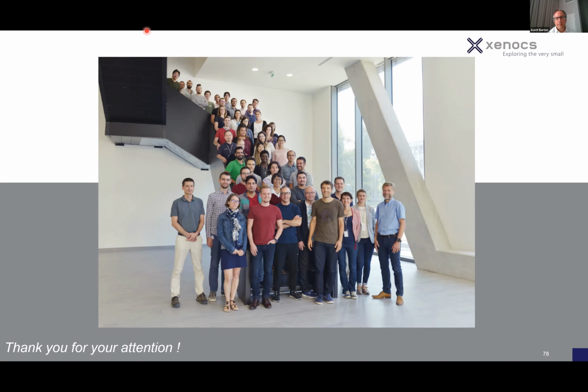This is from Nipa. How does peak intensity correspond with sample thickness? I have 1D data and 2D pattern of SAXS for my samples, which can be heterogeneous. I need to make a comparison between intensity spots of the heterogeneous sample. What types of information are required to conduct absolute intensity calibration? It sounds like there's a series of things.